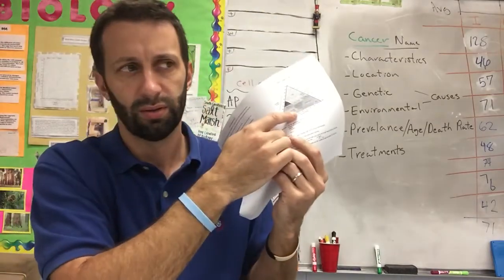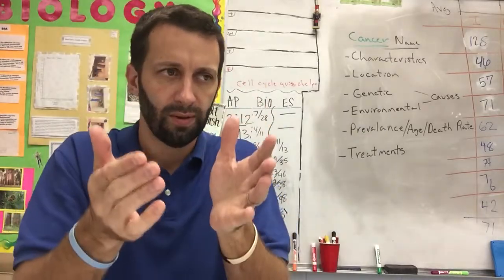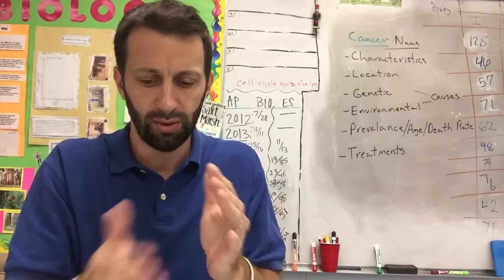Does that make sense? Okay, but it takes 30 minutes to let it settle out. So once you mix it in there, it's going to take a while. So we need to get it started first. You can do the other labs, and then you can come back to this.